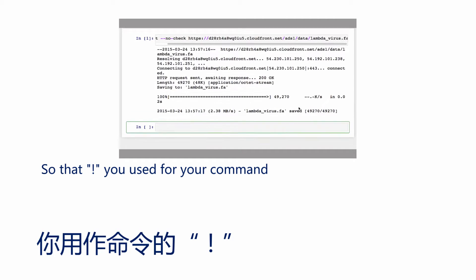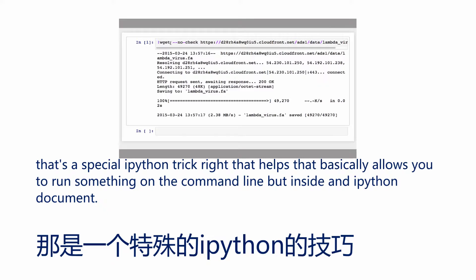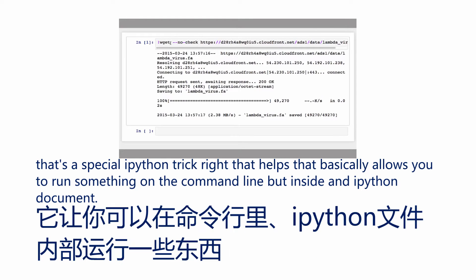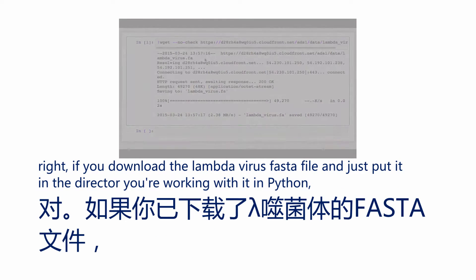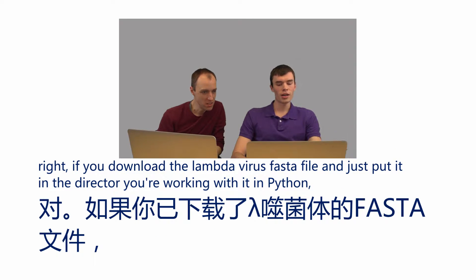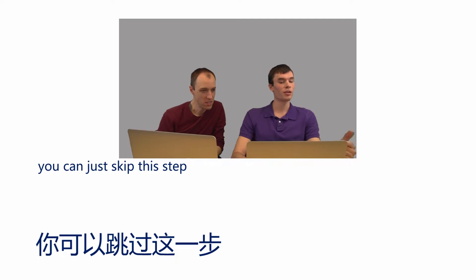That exclamation point is a special IPython trick — it basically allows you to run something on the command line inside an IPython document. If you download the lambda virus FASTA file and just put it in the directory you're working with in Python, you can just skip this step.